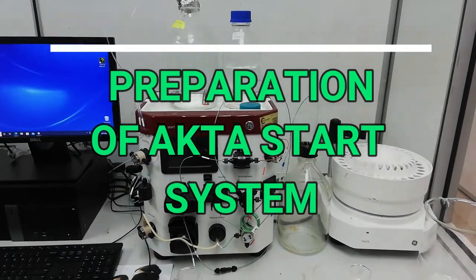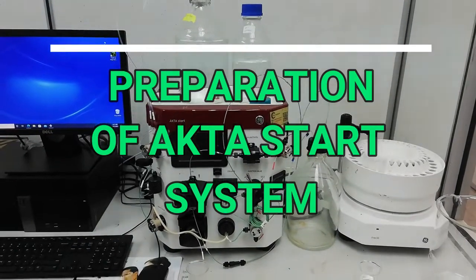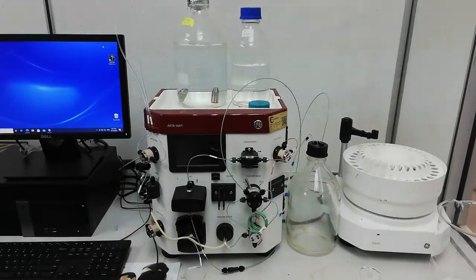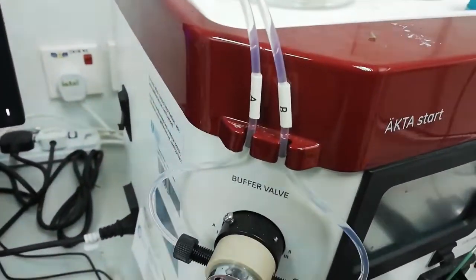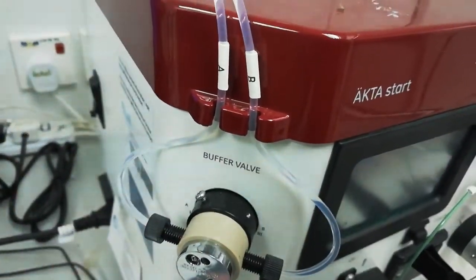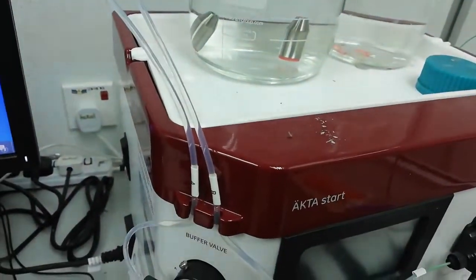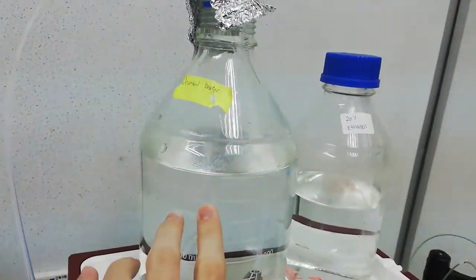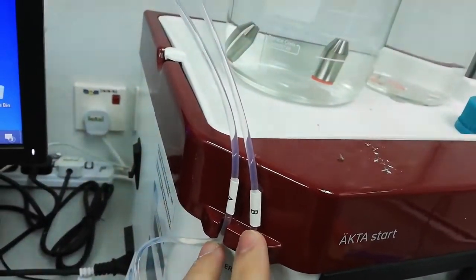The first part is the preparation of the ATASA system before studying it. There are four parts to notice before using the ATASA system. As you can see, there is pipe A and pipe B — one is a buffer wire. If you are not using it, we have to put pipe A and pipe B inside the ATASA system.